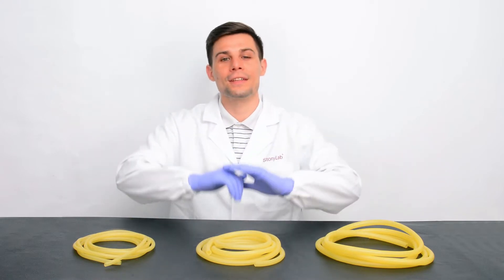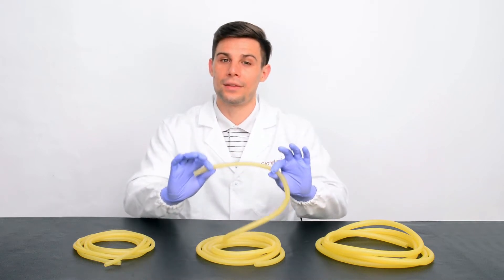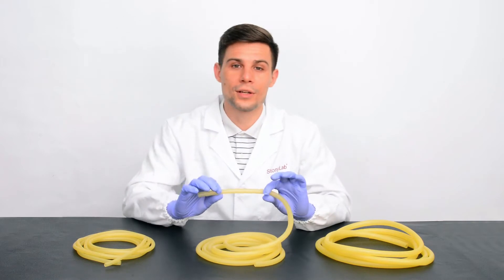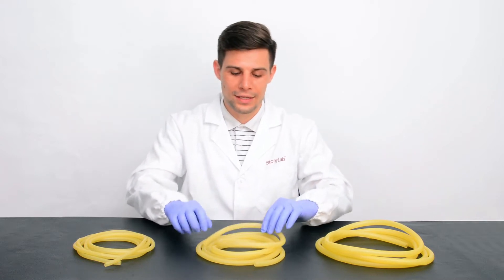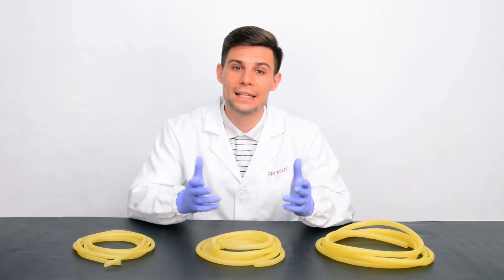The first thing I want to tell you is that the color is uniform, and the resilience and ductility are great. It's made of premium natural latex with an exquisite processing craft, and our rubber tubing performs great in anti-corrosion and anti-aging.